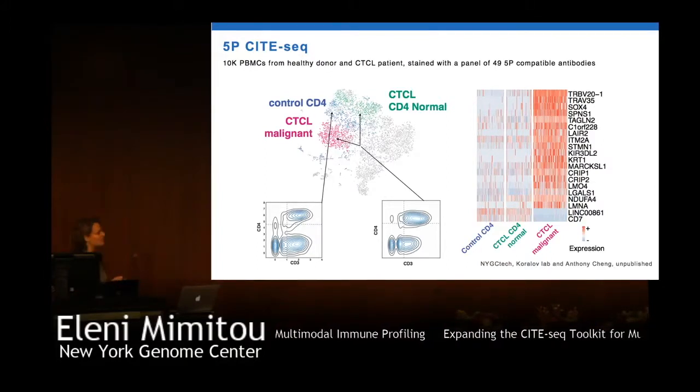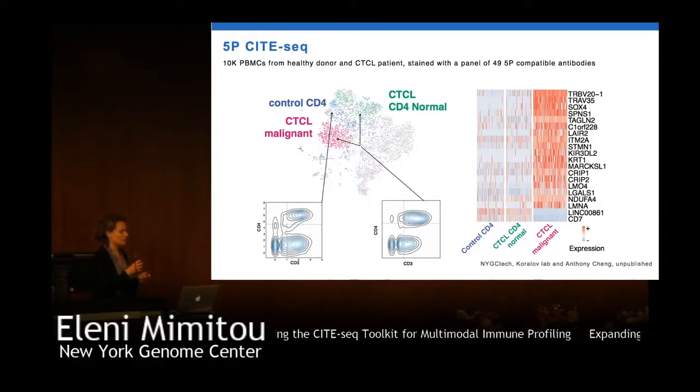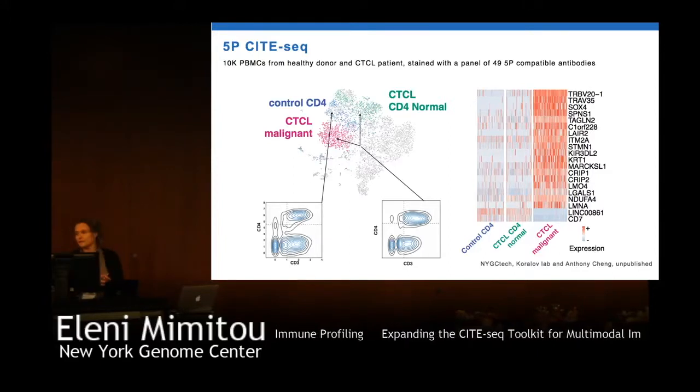Moving on, another avenue that we wanted to explore, and that's made again feasible by the 5' protocol because of the custom RT primer being soluble, is direct guide RNA capture. So again, as Brian very well presented a few hours ago, it becomes obvious how, when we do CRISPR pooled screens, how important it is to get a readout at a single cell level.